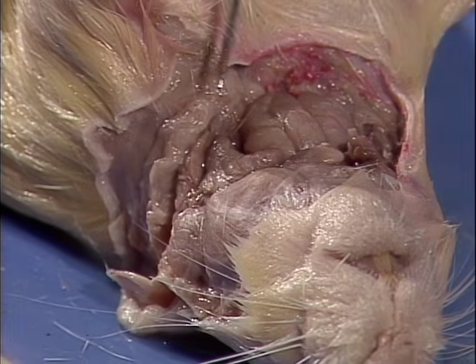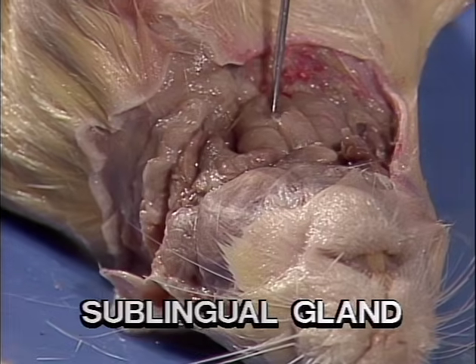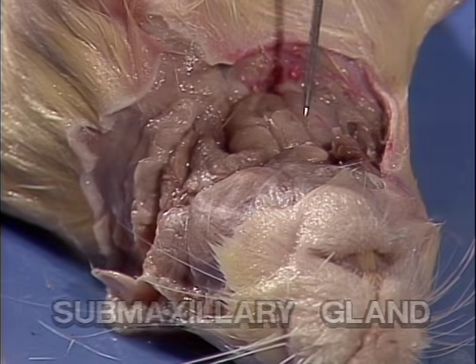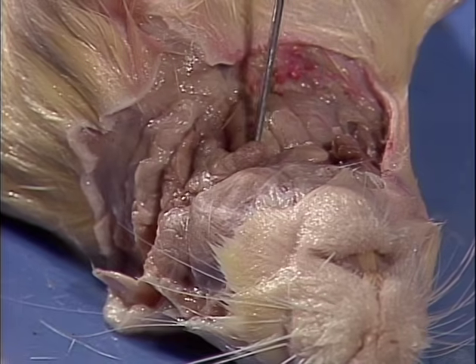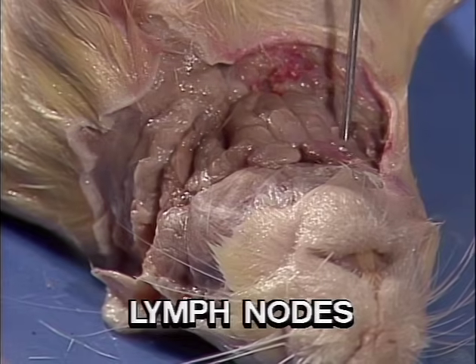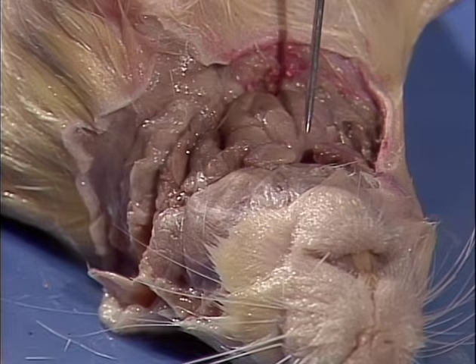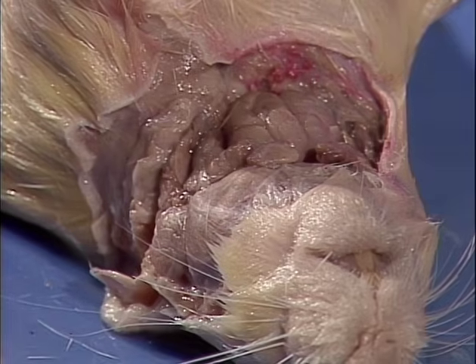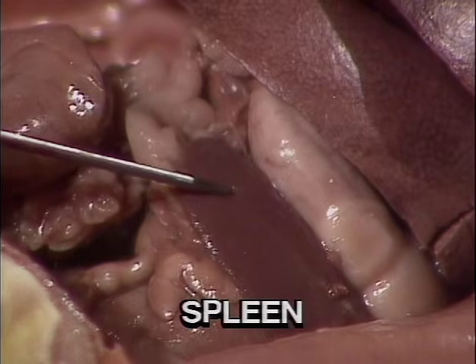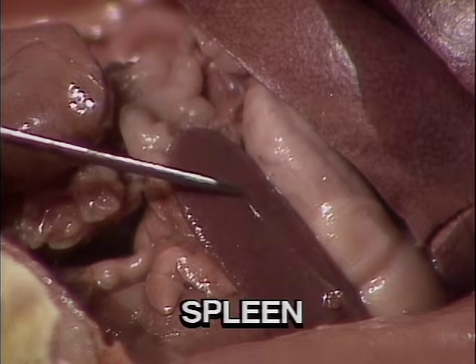There are 2 other glands located next to it. One is the sublingual gland. The second is the submaxillary gland. They also produce saliva. In the throat region, we see 4 lymph nodes. These are involved in the immune system of the rat. This long, dark, reddish structure is the spleen. It is part of the circulatory system and functions in the storage and release of blood cells.